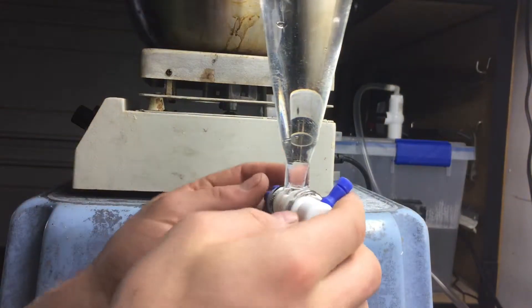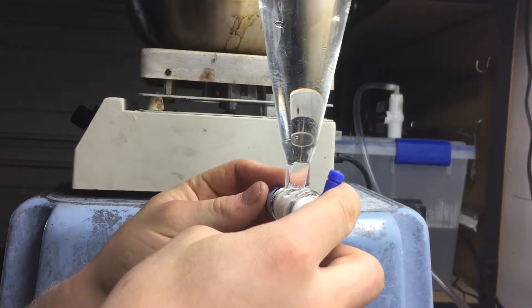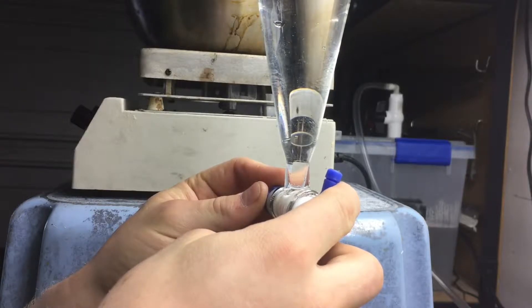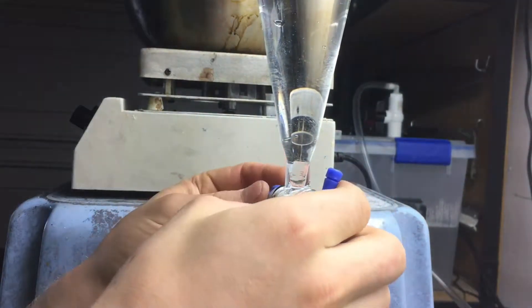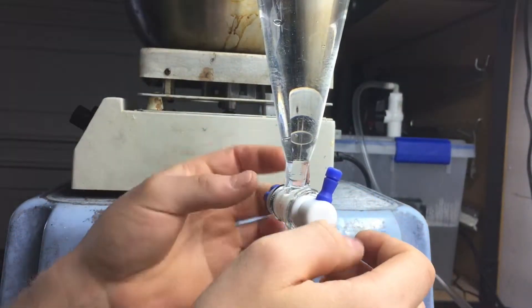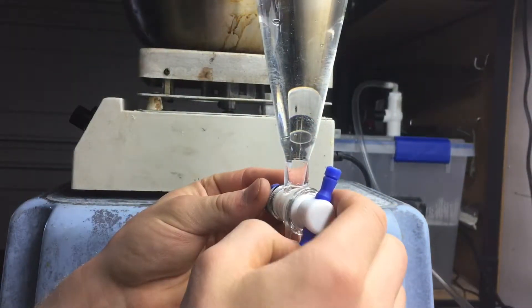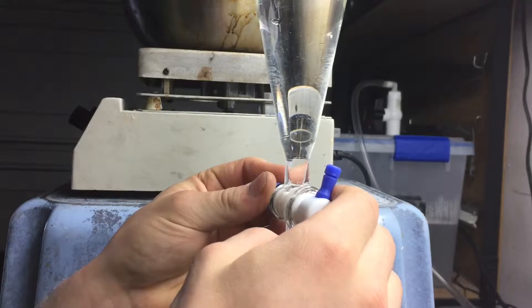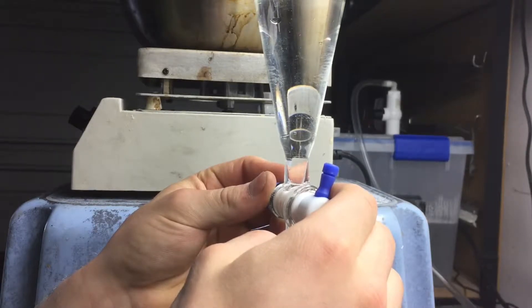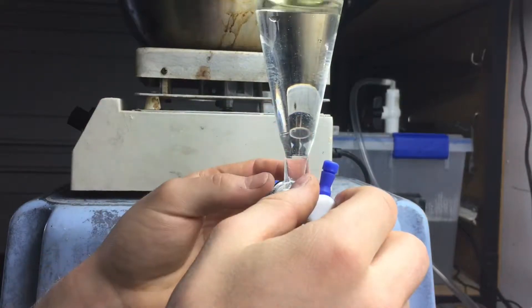Now we can let the water sitting below the oil out. I think I called it supernatant liquid earlier, which is incorrect — it's actually called hydrosol when it's below an oil like this. Supernatant liquid would be above, which would be the oil. Anyway, let the water out a little slow so we don't lose any oil droplets that are wetted on the side of the glass.